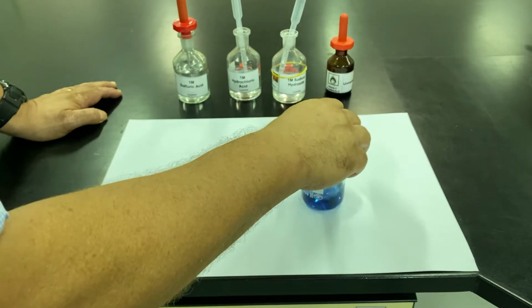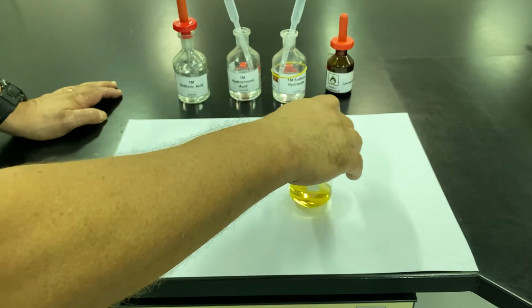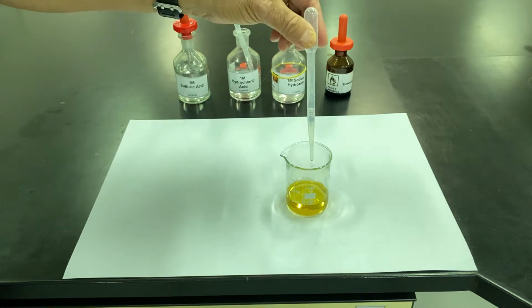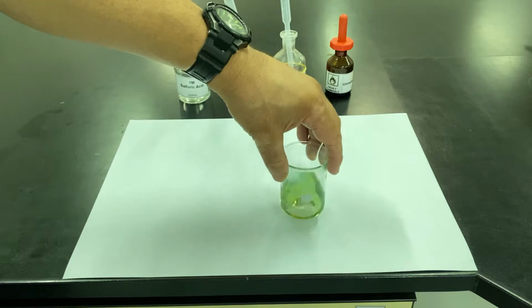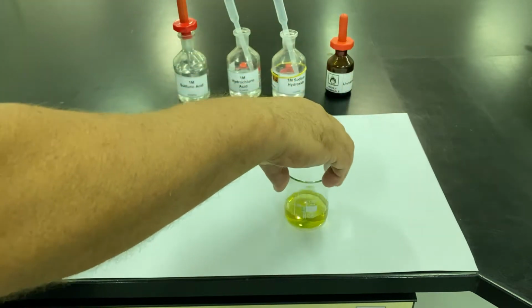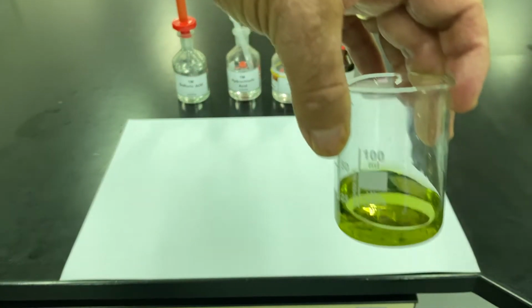So what am I after? I'm after a neutral solution, which, if you remember, what colour is that? The neutral solution should be green, so we're very close. Yellow, as you remember, is a pH that's very close to 7. Okay. So it's almost there, isn't it? I reckon one more drop. There we have it, green. So that's now a neutral solution.